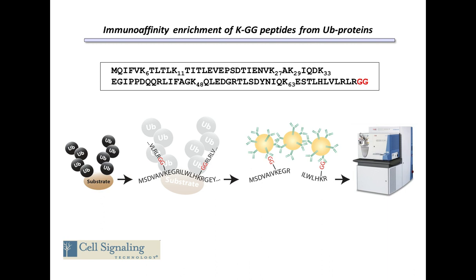structure. And at the position where ubiquitin is attached to the substrate, you can see this branch really begins with the C-terminal diglycine of the ubiquitin protein. Now, in our traditional workflows, we digest proteins with trypsin, which naturally cuts at the arginine at the -3 position, liberating this diglycine remnant. And it's this remnant that can be effectively captured using the antibodies that were developed at Cell Signaling Technology. In fact, this ability to enrich GG peptides really opens up the ubiquitin field to the kinds of mechanistic studies that are really important for us to understand its role in cellular processes.